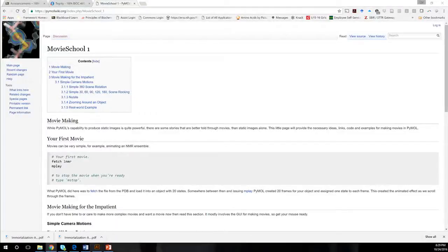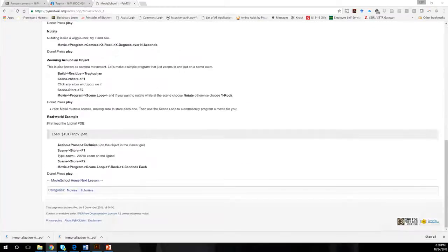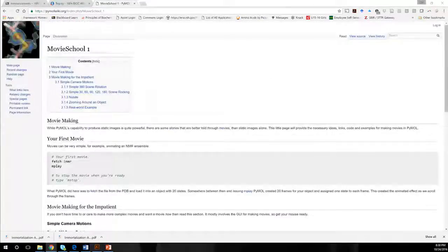Welcome. I'm going to show you today how to do some simple movie making in Pymol. If you go to this website here, you can just do a search too on Pymol movie making. I'm going to take almost everything I do out of this website. I'm just going to show you how to do all the stuff that they describe in here. So it should be pretty straightforward.